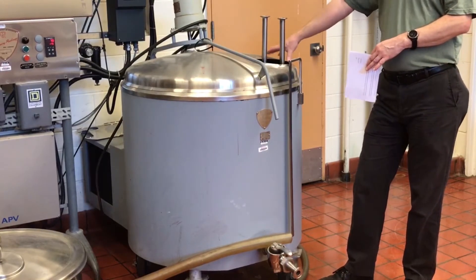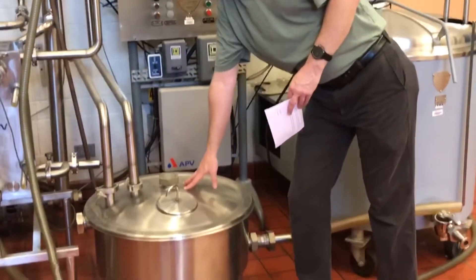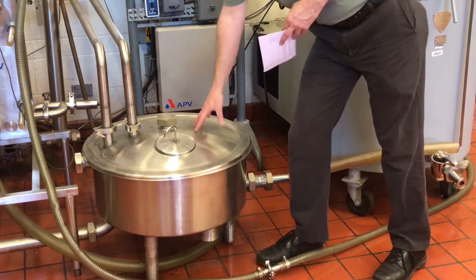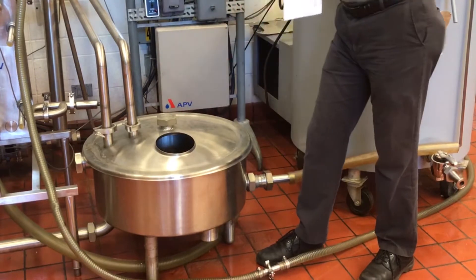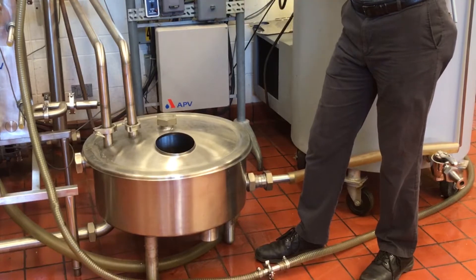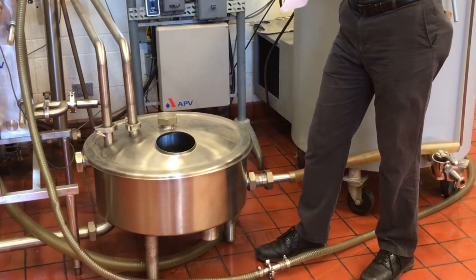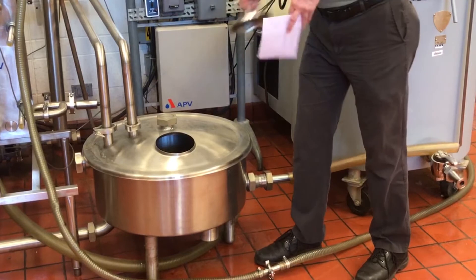The milk then travels from the refrigerated holding tank into our constant level tank. The constant level tank is basically designed, as the name implies, to keep a constant level of milk in the system and feeding the system. Inside we have a float system which is very similar to what you would have with your toilet at home — just a simple float system that will keep the raw milk in the constant level tank at a nice consistent level.